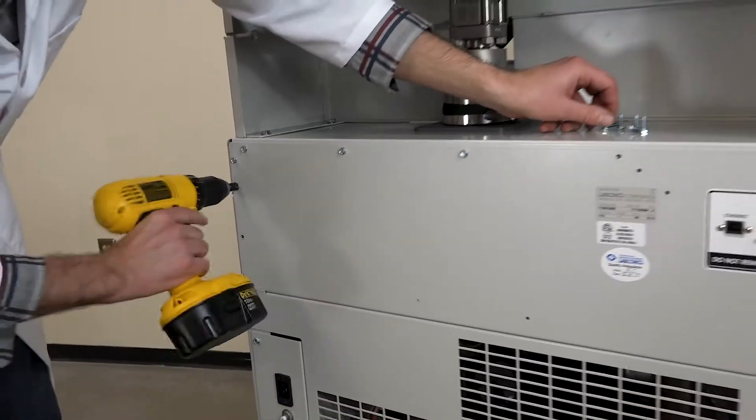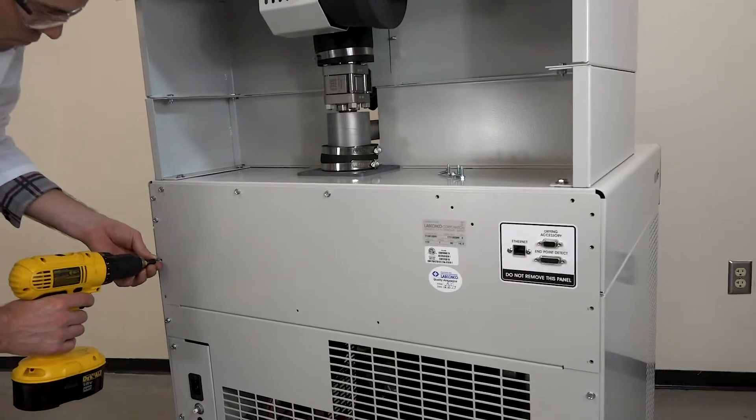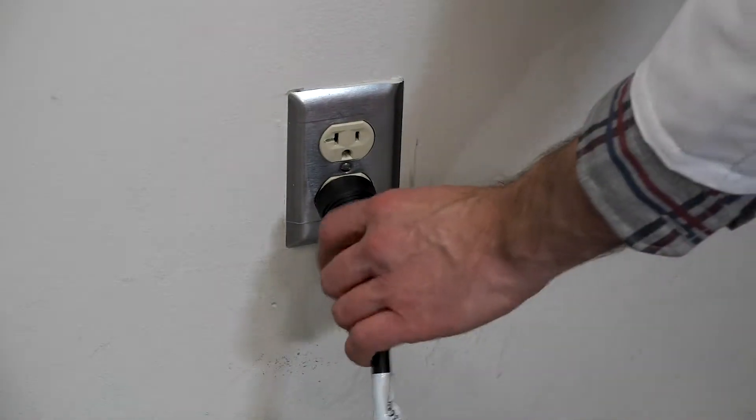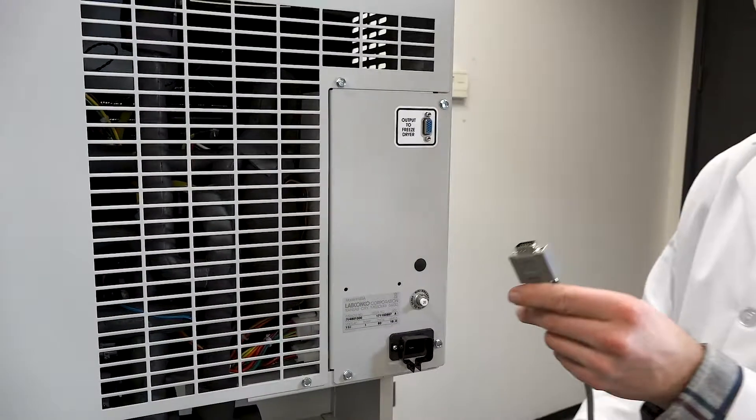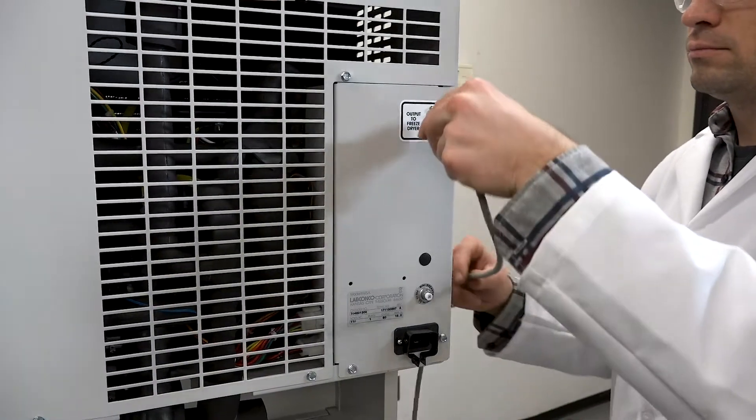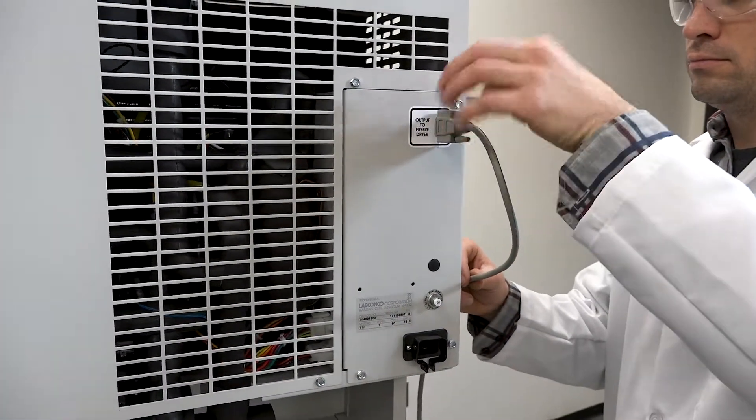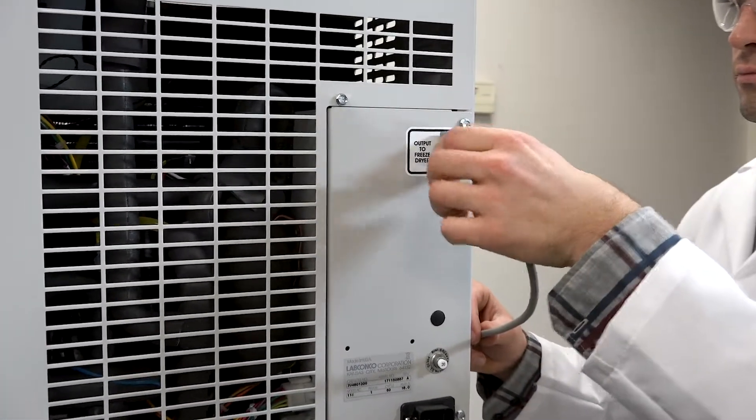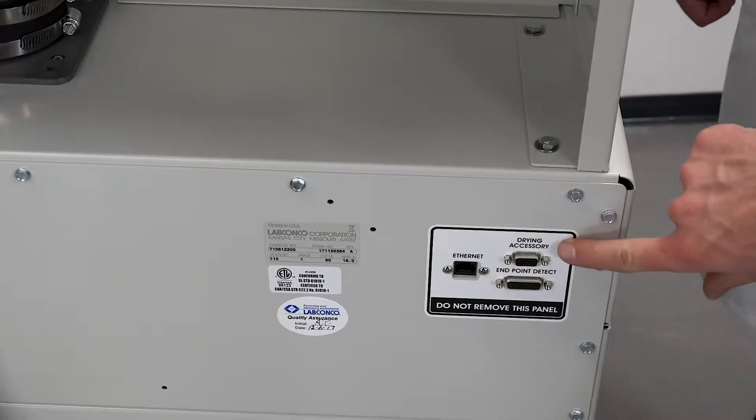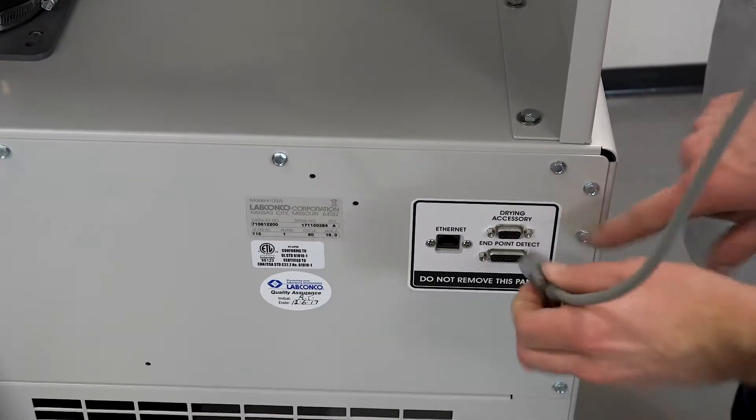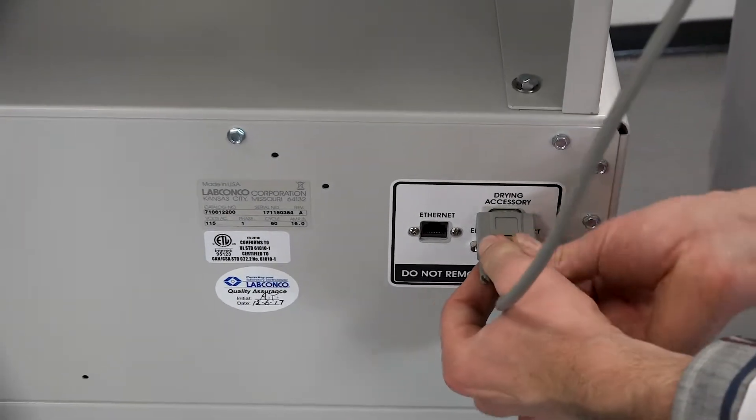Make sure the stopper and tray dryer and FreeZone console power cords are unplugged before connecting the communication cable. Connect one end of the communication cable to the port on the back of the stopper and tray dryer labeled output to freeze dryer. Connect the other end to the port on the back of the freeze dryer labeled drying accessory.